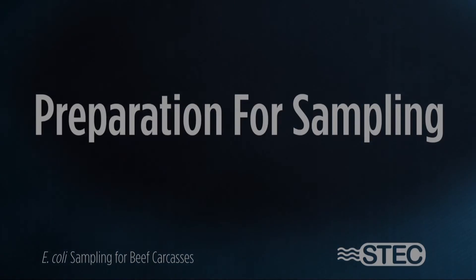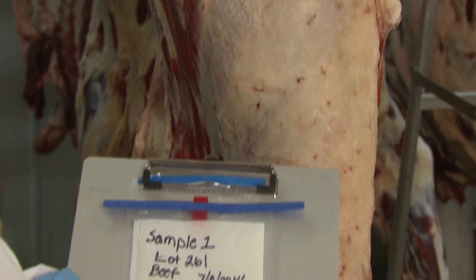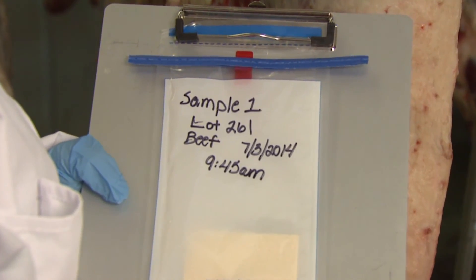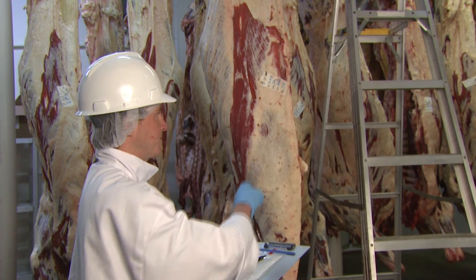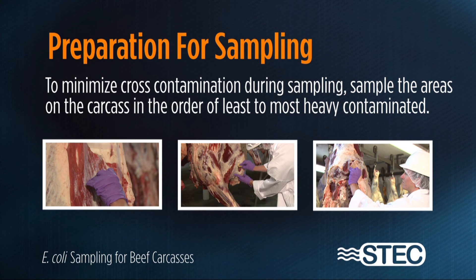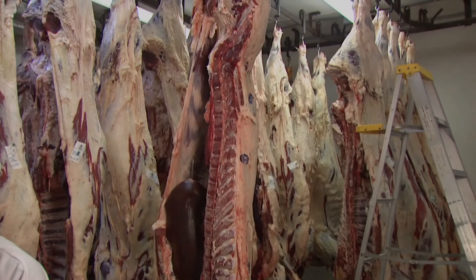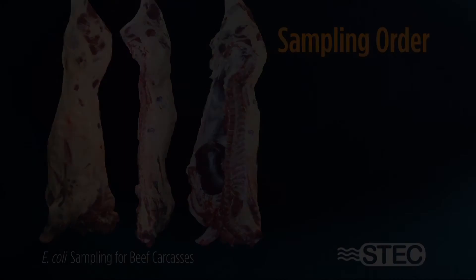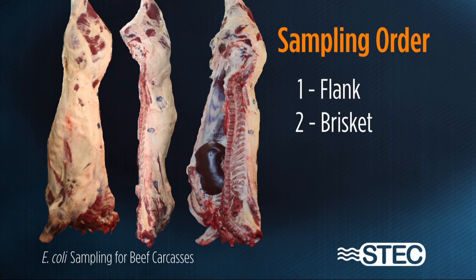To begin preparation for sampling, a sample bag should be pre-labeled with the correlating carcass number, carcass side, date, and time of sample collection before the sample is taken. This information should also be recorded on records maintained by the slaughter establishment. To minimize cross-contamination during sampling, sample the areas on the carcass in the order of least to most heavily contaminated — plan to sample the flank first, then the brisket, finishing with the rump area of the carcass.